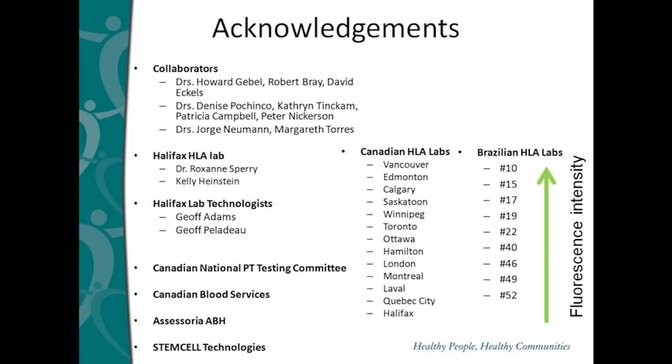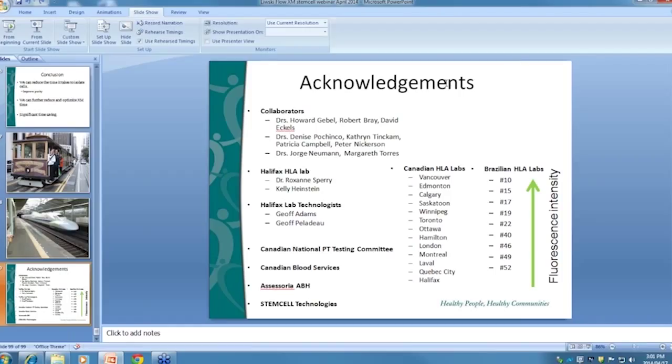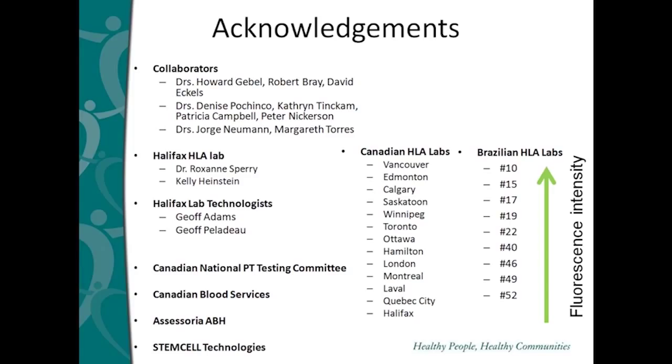The simple answer is yes, it can be used with a buffy coat, but it does depend on the red blood cell content that you have in the sample. And it also depends on the size of tube that you're using. So in the larger tube, you need to have a packed red cell volume of 2 mils basically to ensure that your enriched layer is above the insert. And obviously this is much smaller in the 15 mil tube.